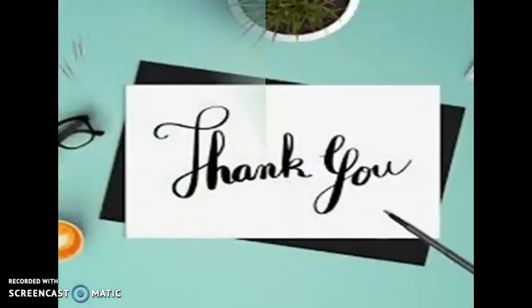So that's all about the hot air oven: mainly the principle, definition, procedure, different types, and the different types of materials used in the hot air oven. Thank you.